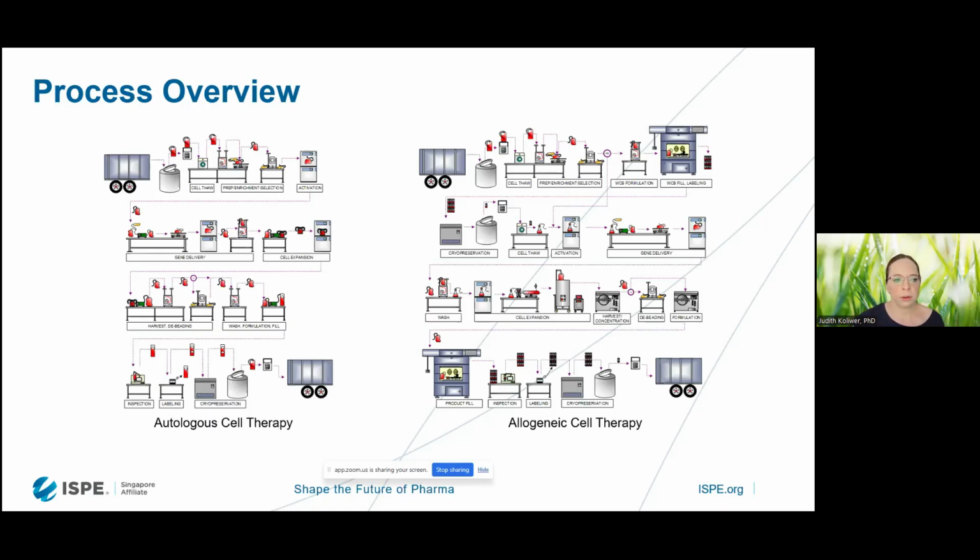So I assume because we are meeting here on ATMPs, we don't need to discuss too much about the actual process, but maybe just very briefly, we have now just assumed that we are starting with frozen cells that are arriving from the hospital. And then we would probably have a storage. And then, of course, we need to thaw our cells first. And then we connected our prep, enrichment, and selection section. So where we would, for example, select for CD4, CD8 cells, or enrich CD4 and CD8 cells, or a particular phenotype of NK cells, or whatever we really need.